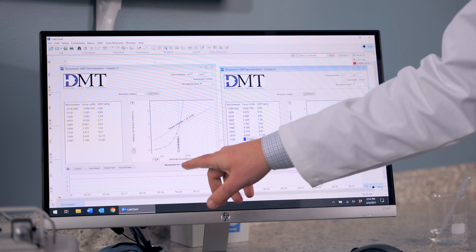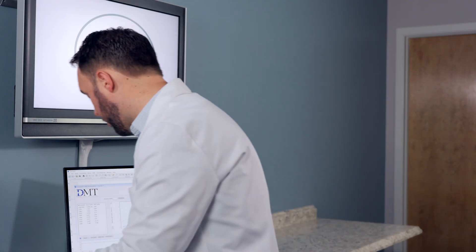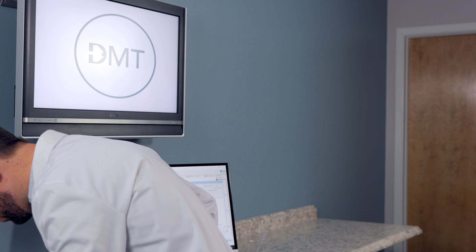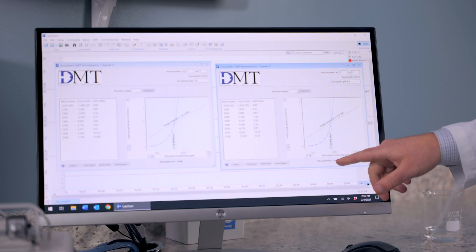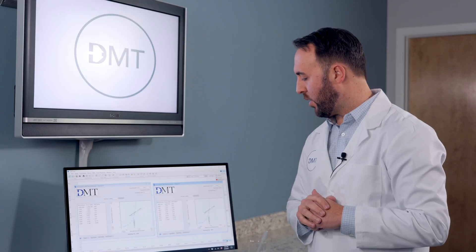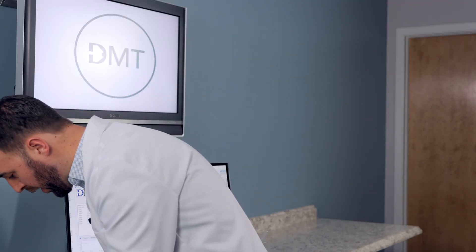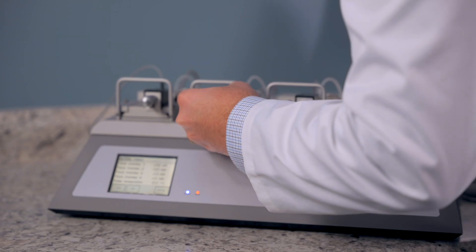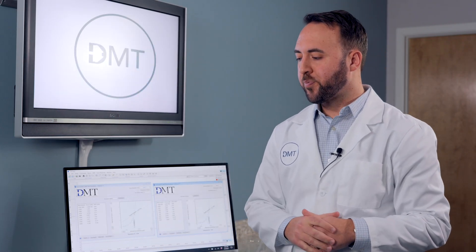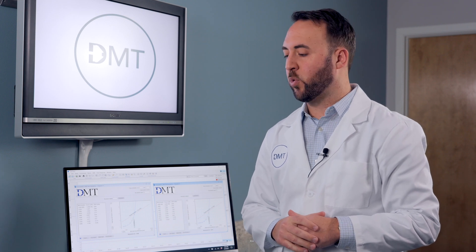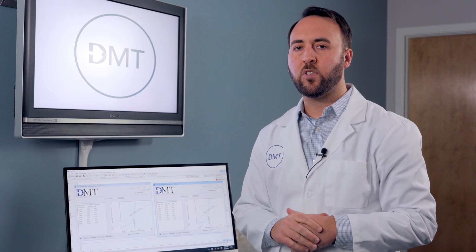Channel 1 suggests we set it to 2,558, so we will get as close as we can to that number. Channel 2 has also passed the line, and in this case its reading is set to 2,076. So we will move these back to those values. Now that you have done this, you can zero your chambers — your reading for chambers 1 and 2. This is the point at which you are ready to move on and start the wake-up protocol.